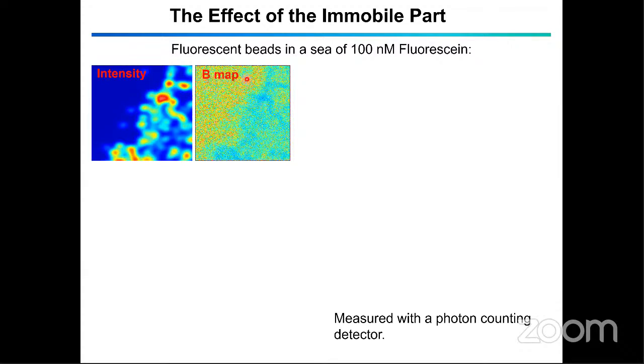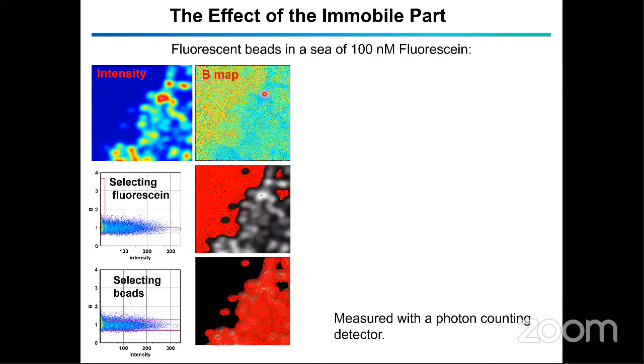If you calculate the brightness map, you see that it's kind of inverse, because in the calculation, the immobile fraction has a brightness of 1. So these are these bluish color codes here where the beads are. And then from the molecules that can move, you have the additional component from the fluctuations from the movement. So we have this higher apparent brightness here. Here we have it quantified.